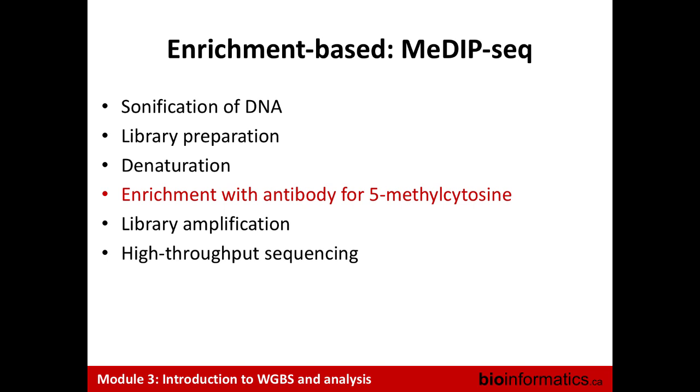Okay, I think the confusion is because it says library prep, denature, enrich, and then library amplification on the slide. So maybe what's the difference between library prep and library amplification? No, there's no bisulfite. That's right. So it's just an antibody sensitive to methylated CpGs. So when you do the library prep, you don't do any amplification? No, you just ligate, and then you don't do PCR.